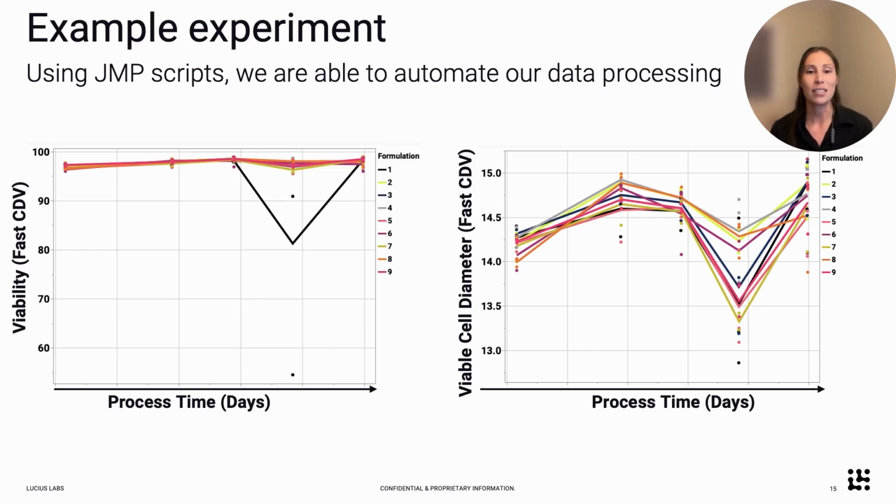So all of this data is automatically generated by the FAST CDV, and we're able to immediately pull it with minimal effort.